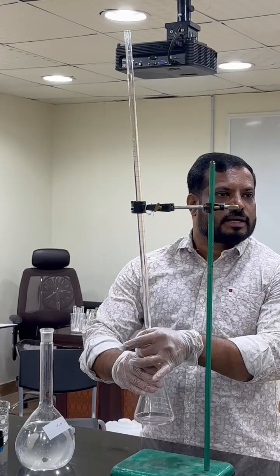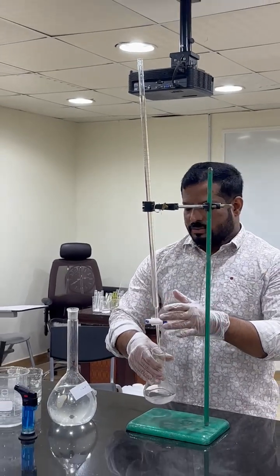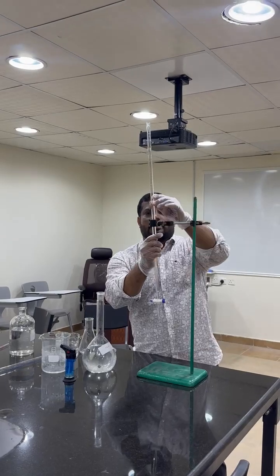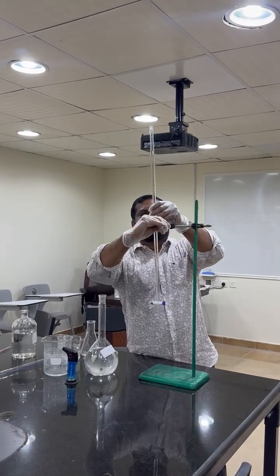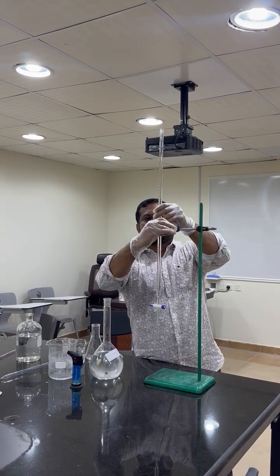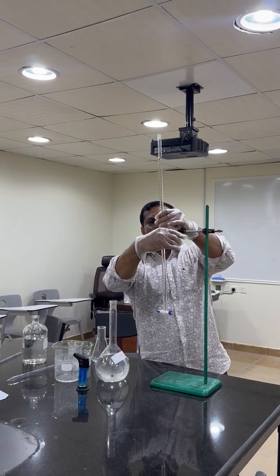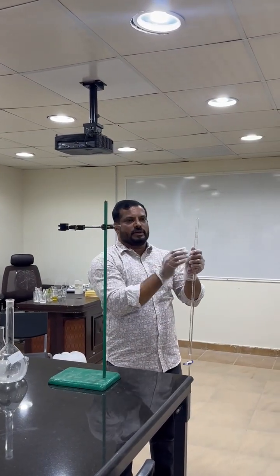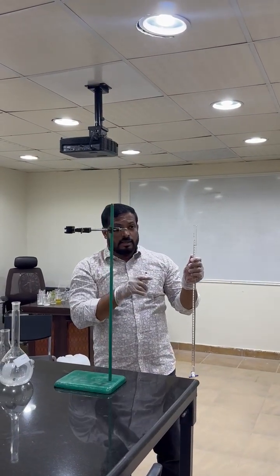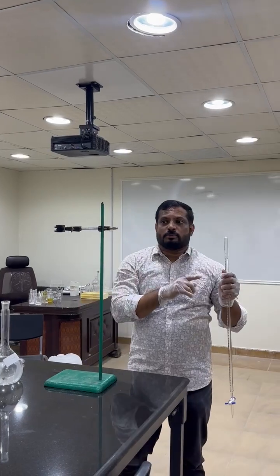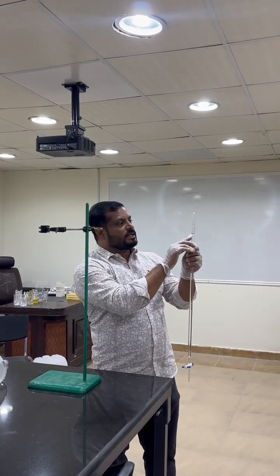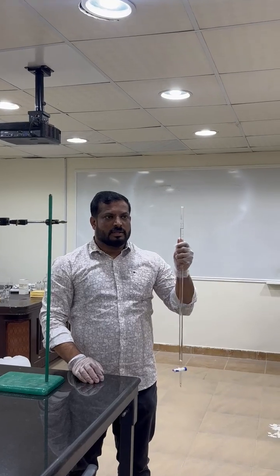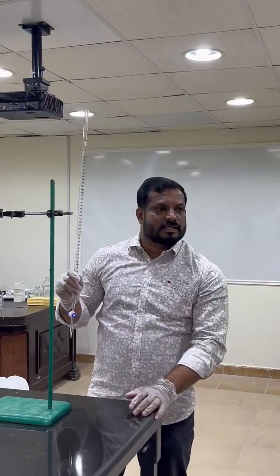That means our titration is completed. Now carefully remove your burette. In a parallel way, you want to measure how much ml you consumed for this titration. Here I consumed 1.9 ml. That is the volume of HCl.